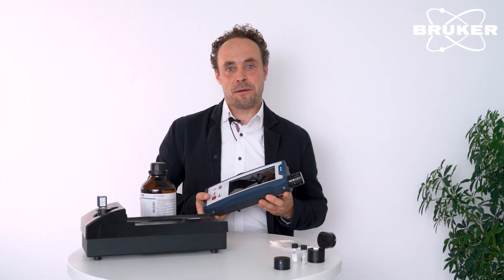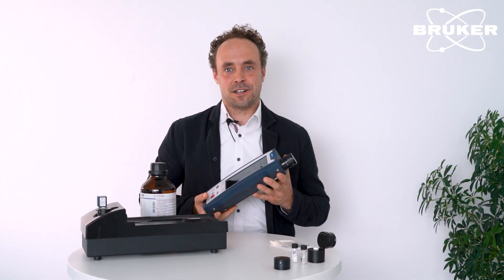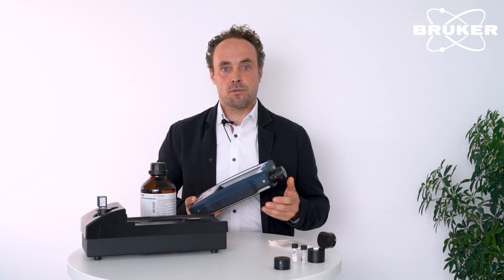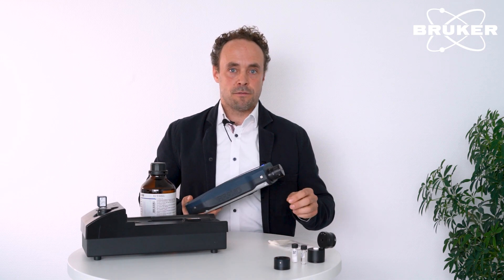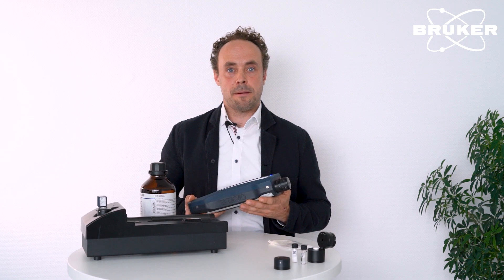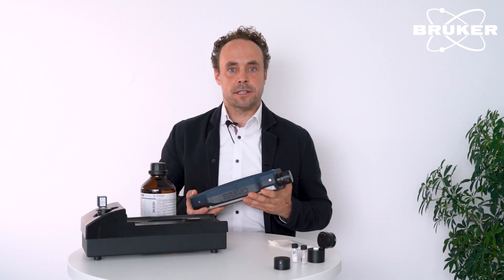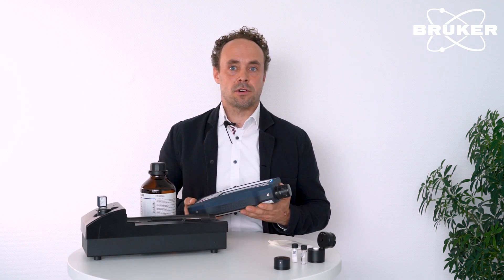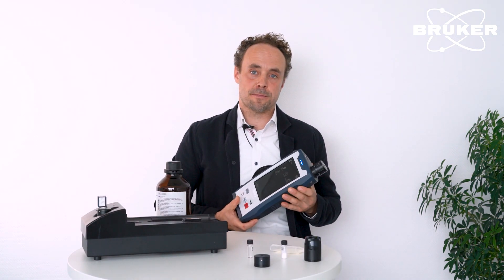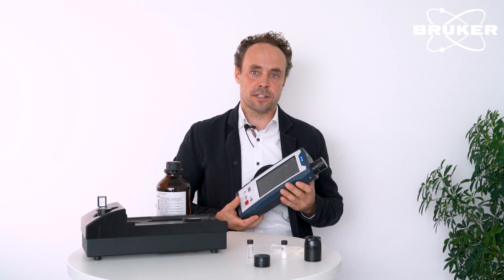You've just seen one of the major advantages of a handheld Raman spectrometer. We can perform the analysis directly through packaging material, so there is no need for extracting samples in sampling cabinets and transferring them into a laboratory. The analysis can be performed directly in the warehouse at goods receipt, prior to production.